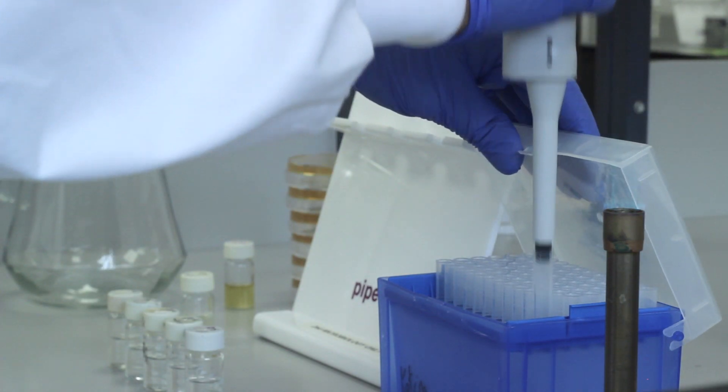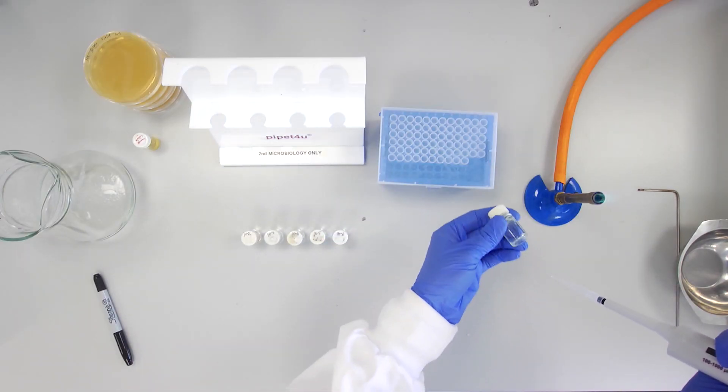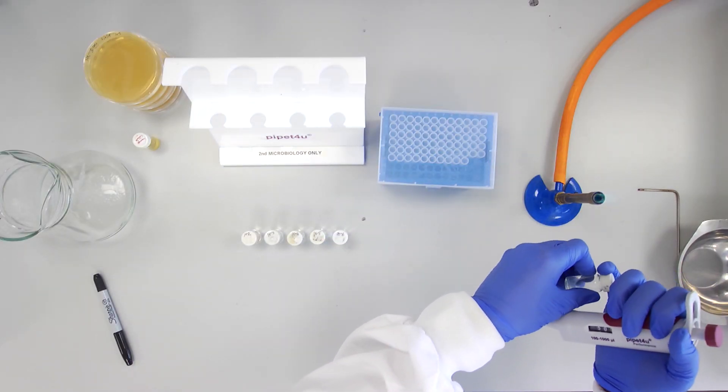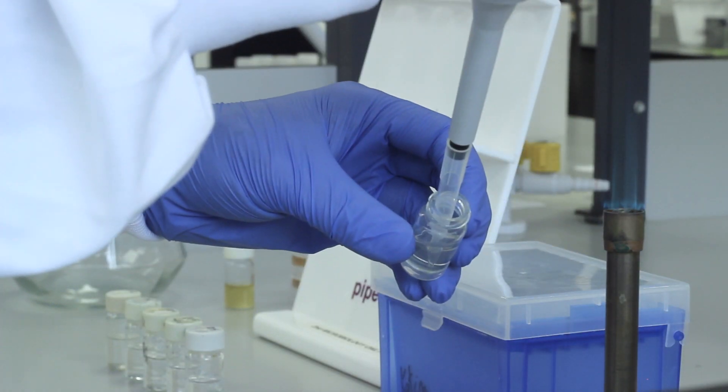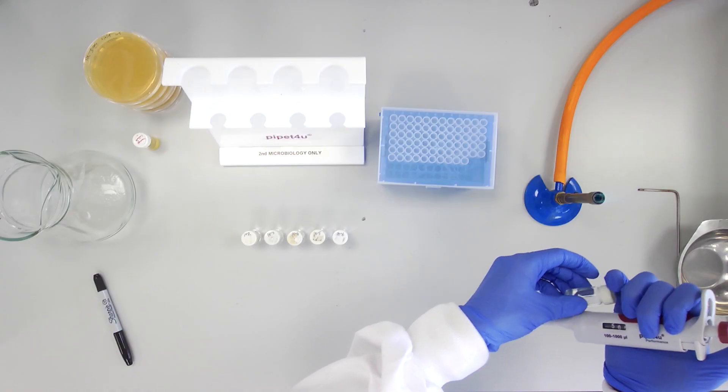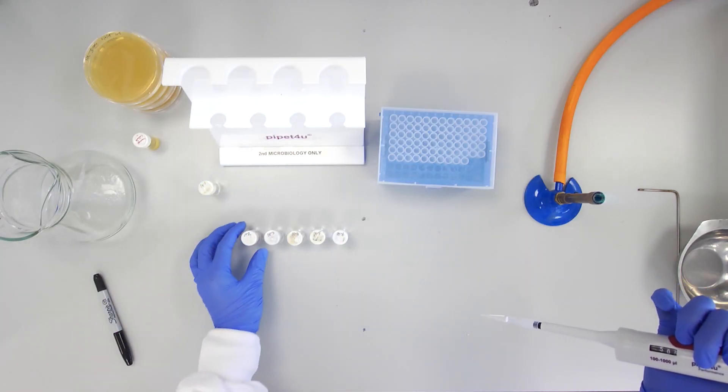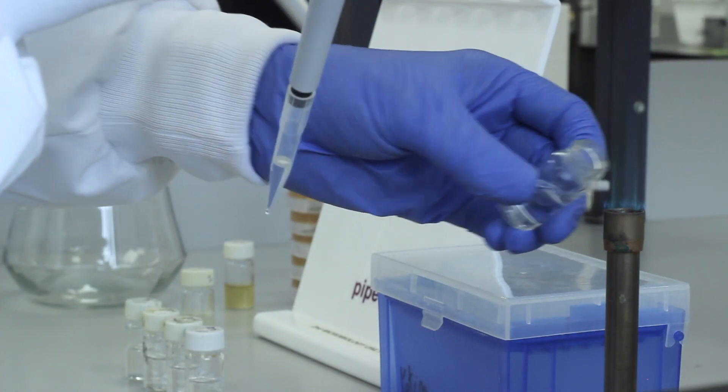Next, using a fresh tip, transfer 500 µl of the 10 to the minus 1 dilution into the next 4.5 ml saline. This prepares the 10 to the minus 2 dilution.